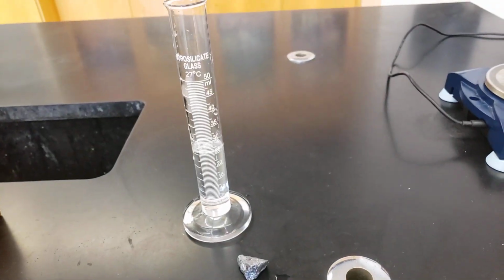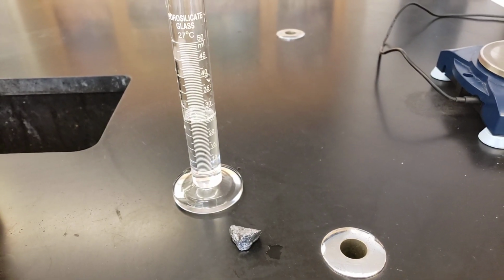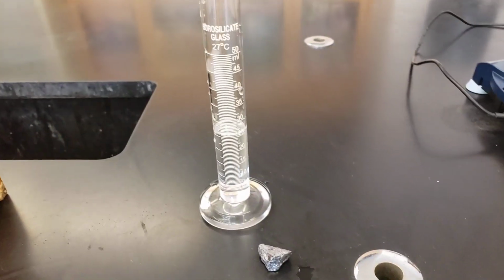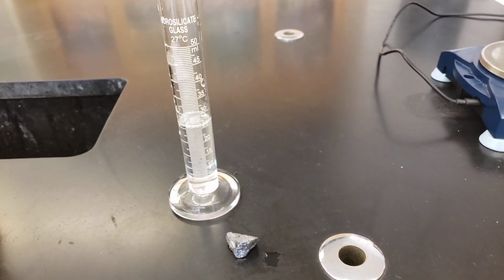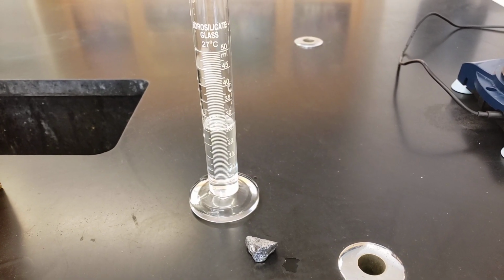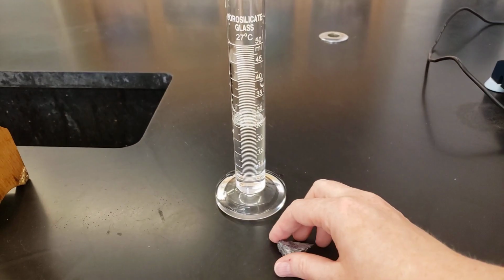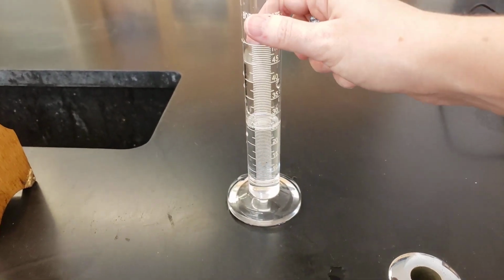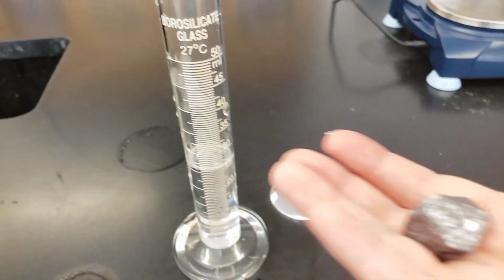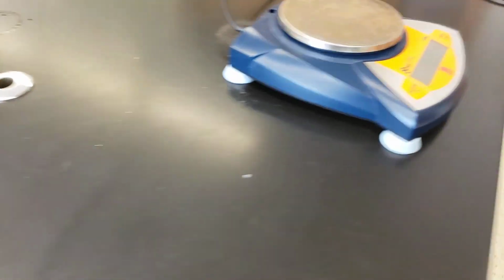Part 3 of our lab involves a trend that we really didn't talk about, and that is density. The density of elements also has a trend throughout the periodic table, and we are going to investigate the density of silicon in order to determine what the density of it is. So right now I have a piece of silicon in my hand right here. Up first, we are going to put it on our balance.